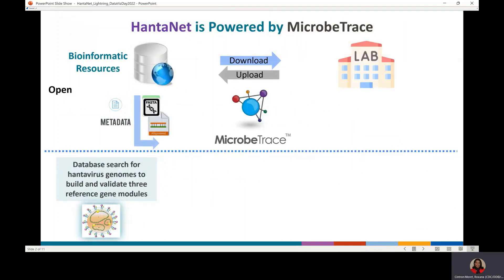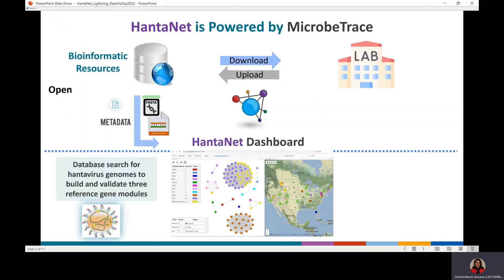Hantanet is a hantavirus-specific visualization and analysis tool powered by MicrobeTrace that facilitates data integration and sharing of standardized sequence and metadata of the hantavirus genome. We built three modules containing pre-loaded reference datasets of the small, medium, and large genes.